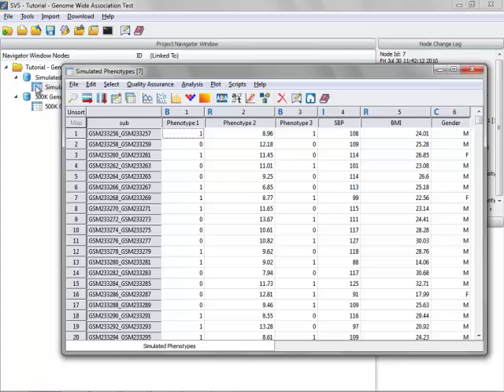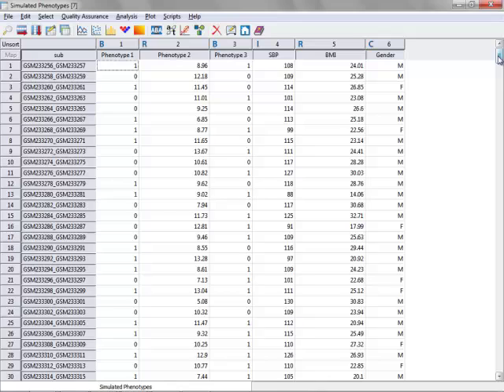you can see that there are six phenotypic columns and 565 samples. Again, this is a simulated phenotype for a dataset that we downloaded from the GEO database. In this first column here, phenotype 1, is the column that we'll be using for the case control status in this association test.